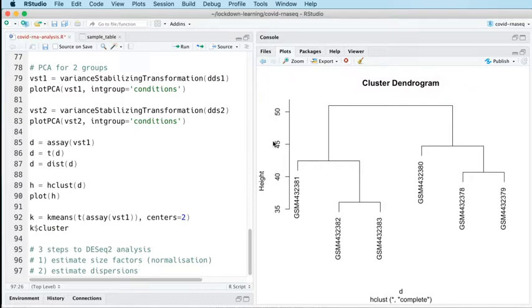You're doing the same thing in a gene expression experiment. You're attempting to measure the mean of expression in different conditions, and you're doing that by measuring a subset of the population. In this case, three sets of cells in culture. Now, we know that 3 replicates in this circumstance isn't sufficient to measure the true mean and the true variance of that population.